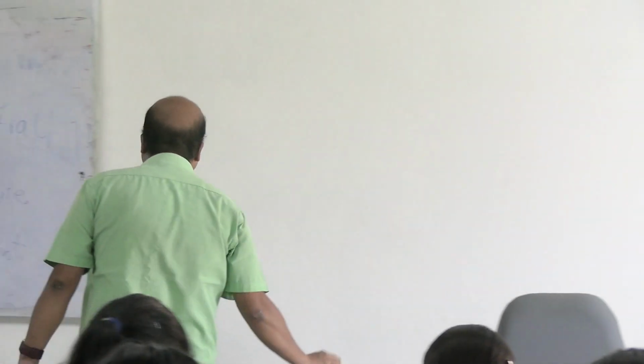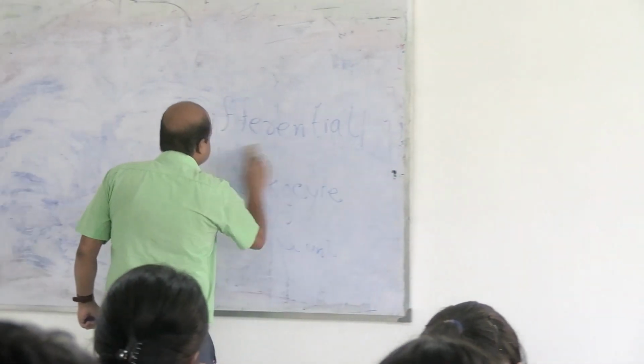So the blood spreads along that edge. Okay. And then with just 1 single stroke, draw the smear on the slide on which the blood is there. Okay. So it will be somewhat like this.